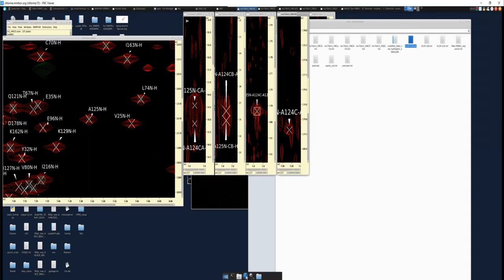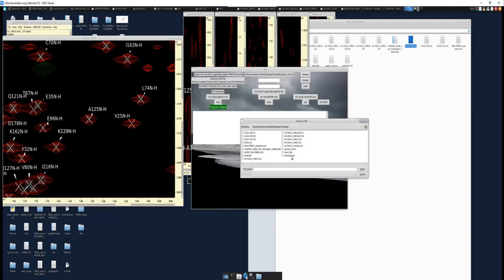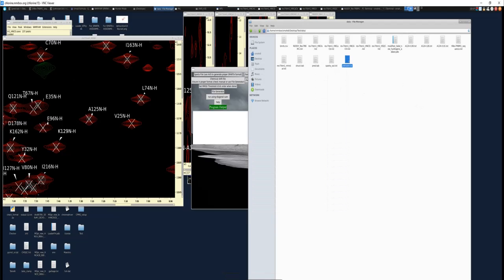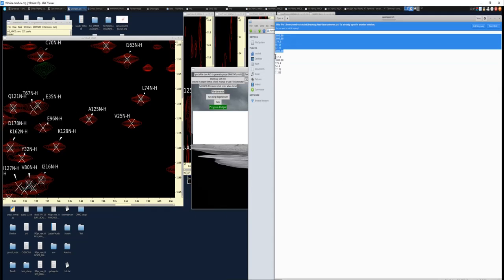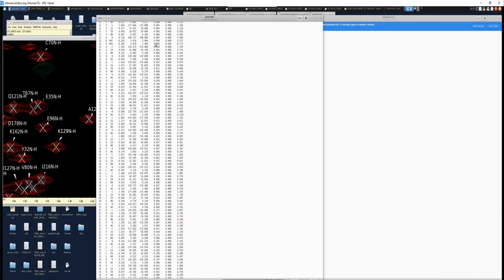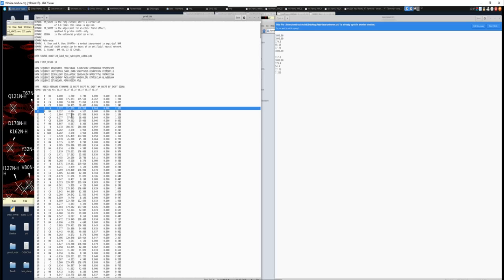So if we go back to APS now, and we click Browse, we upload this unknown text that we just made, and we set an RMSD threshold. So what will happen here is this unknown, you'll notice, is in pairs of 6. And what it will do is calculate the RMSD difference of these two amino acids that we have here, these two pairs of 6. Let me bring this side by side. So this will calculate the RMSD with each pair here.